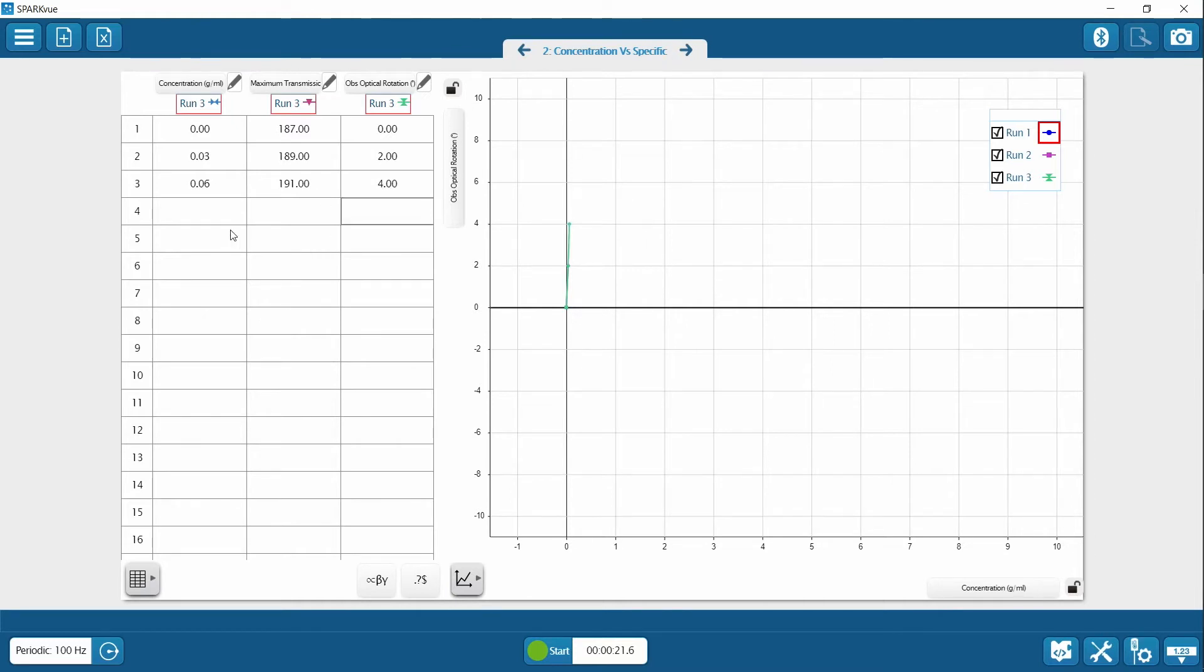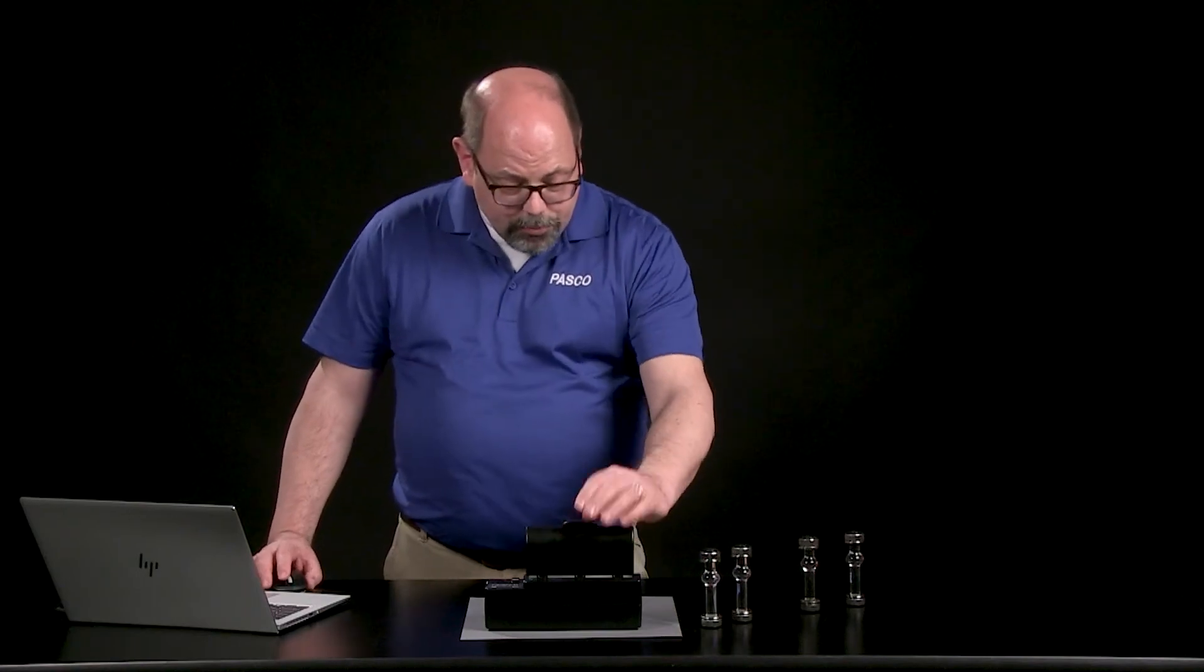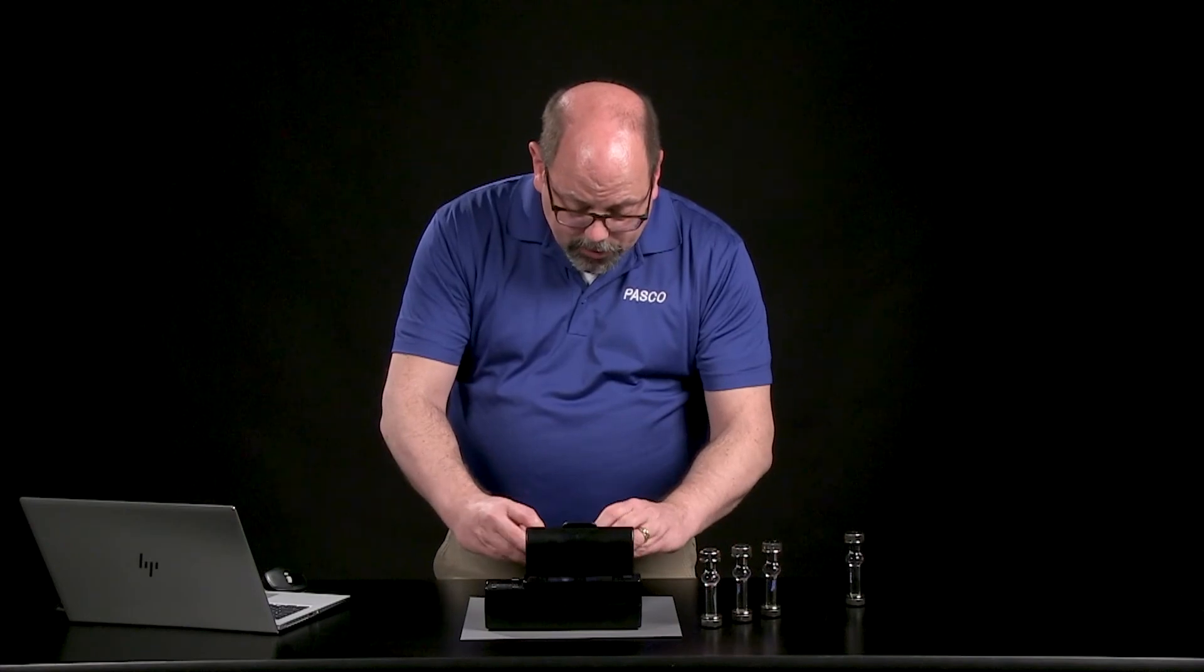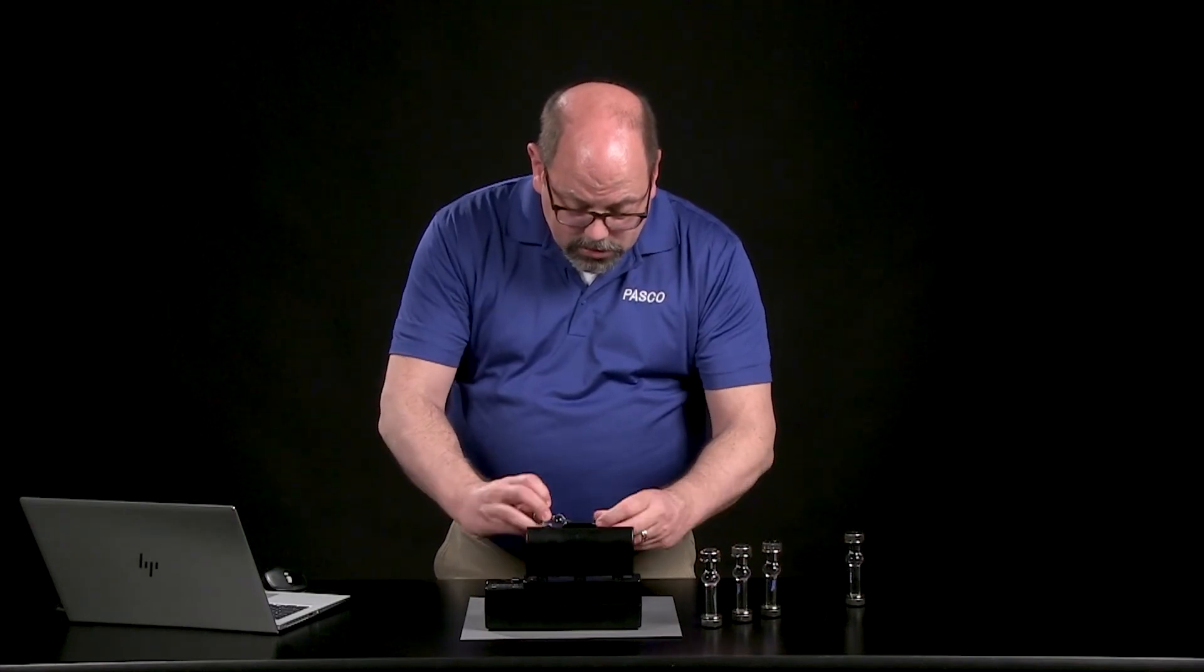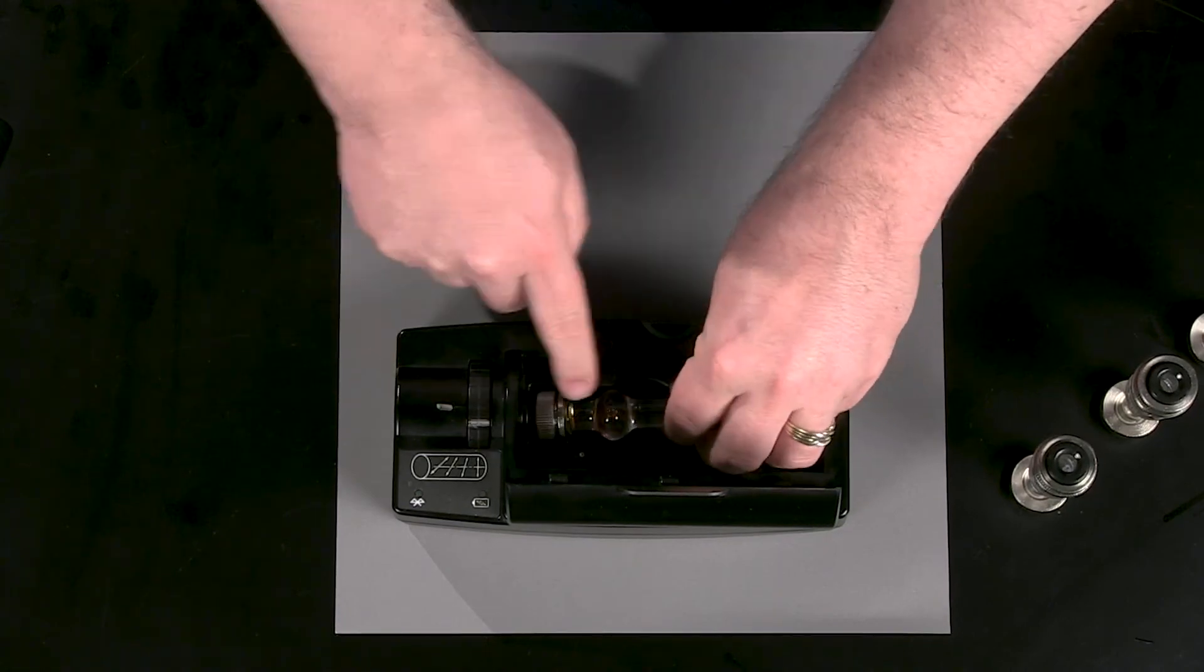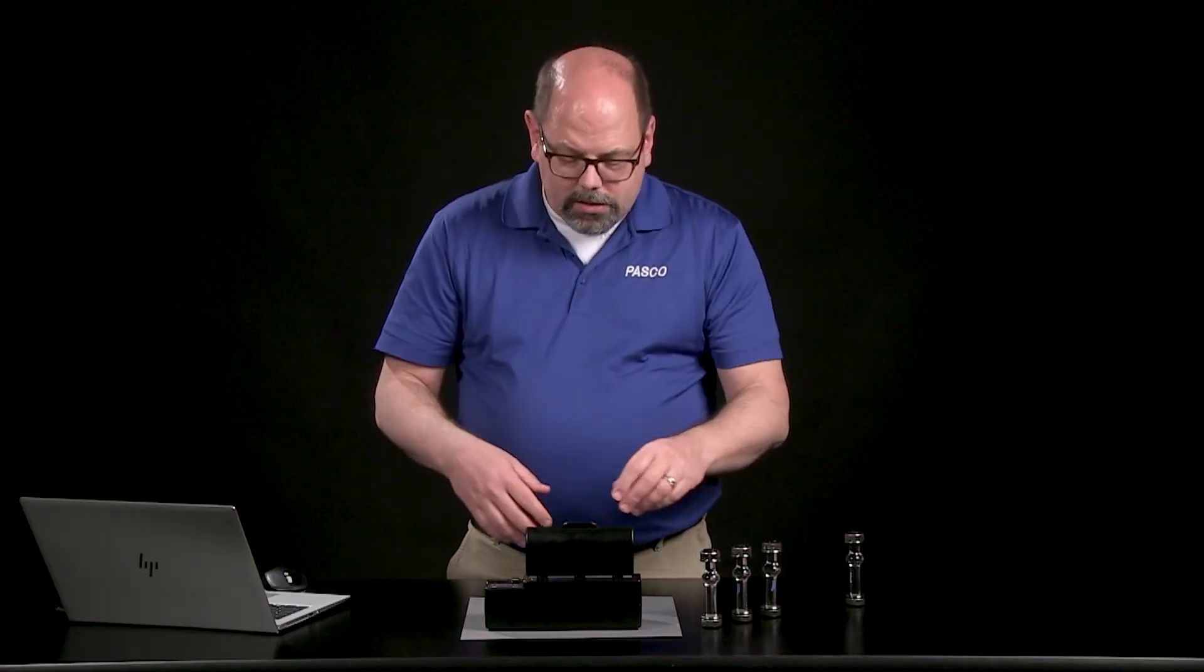All right, and we'll go for the last one to get our curve. Let's run a 10% solution. Again, these are going to be very similar in process to many of the labs. We're going to ask you to do this. This doesn't have a mark on here with the manufacturers, so I made a little mark on there myself with a little red mark so I can orient it the same way all the time.